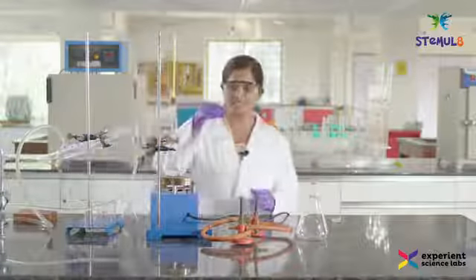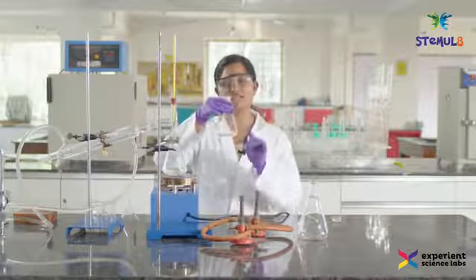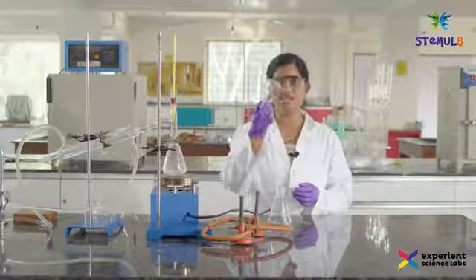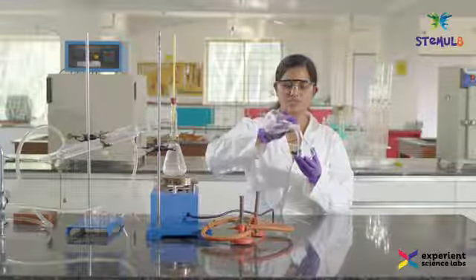Let's test this ethanol. And how do we test this? There are multiple ways to test ethanol, but we'll do something interesting. This is an empty conical flask. I'm going to add a bit of ethanol into this.